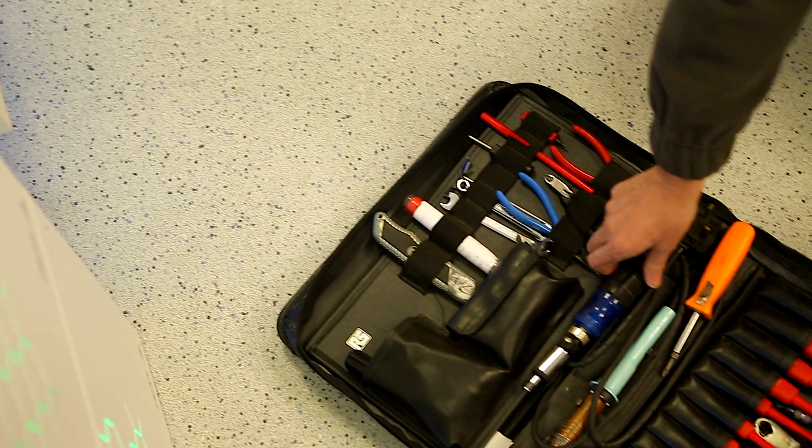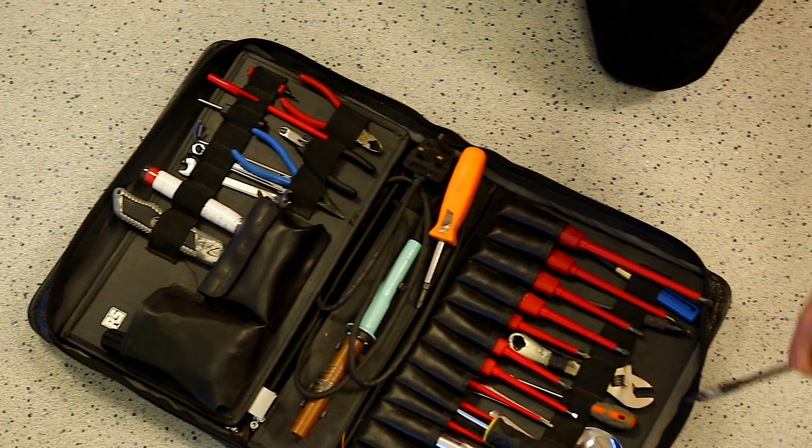We don't take the generators off site. We do all the repairs on site. When our field service engineers get on site, we guarantee that they will fix the issue first time in 95% of cases.